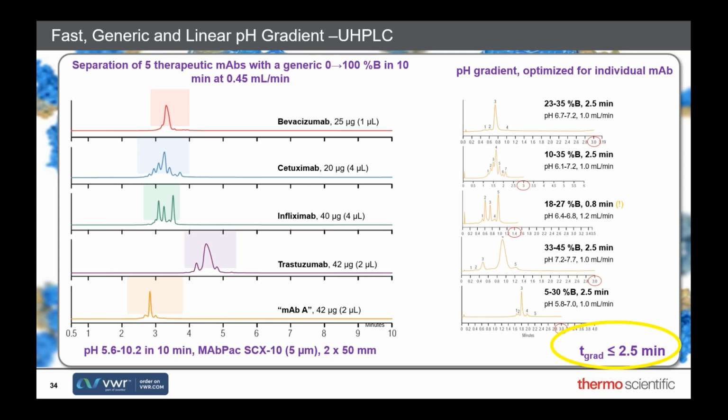And actually, just for reference, if you're thinking about how long that optimization work might take, the total optimization time for these 5 antibodies here was just half a day.